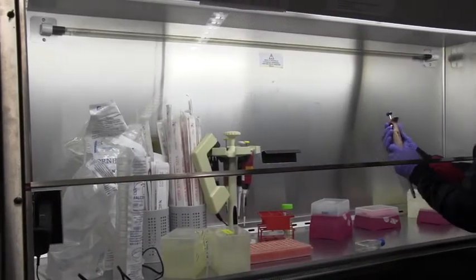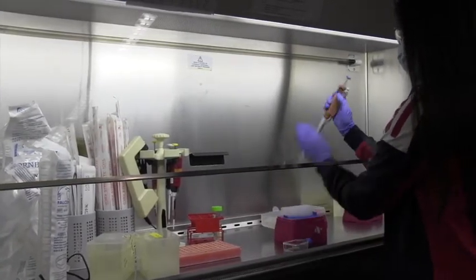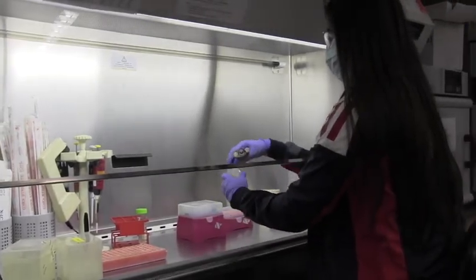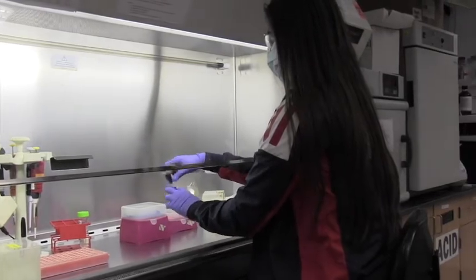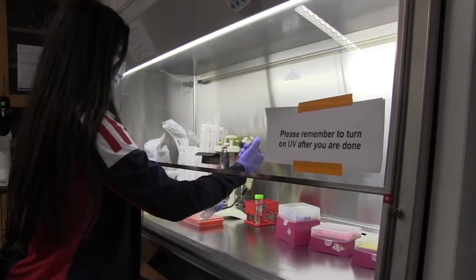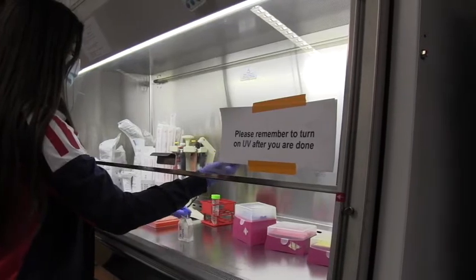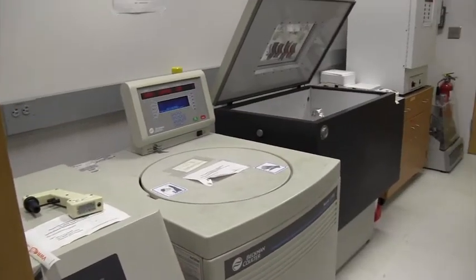This is our tissue culture hood. Tissue culture is a method of biological research in which fragments of tissue from an animal or plant are transferred to an artificial environment in which they can continue to survive and function. In this case, the specific environment is in a flask in our lab. I'm currently using Drosophila, or fruit fly cells, to study circadian clock because it's an excellent model system related to human health.